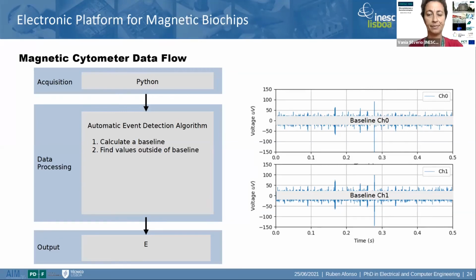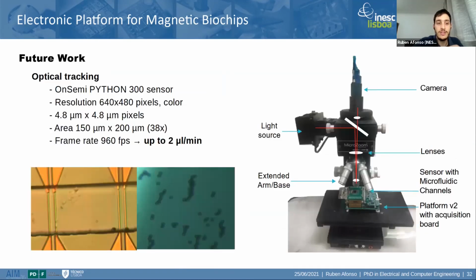Yes. Okay. So in my point of view, this is the final step. Because in the previous experiments we could, for instance, have a concentration, so if you have 10,000 and we detect X, and if we put half, we detect X half too.